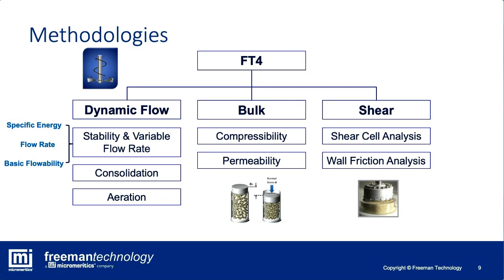We can also look at the powder's sensitivity to consolidation and how much its flow is impacted by the amount of free space between the particles, as well as the sensitivity to aeration, where we feed air in through the powder bed and can characterize how much more the powder is able to flow when it's subjected to airflow.